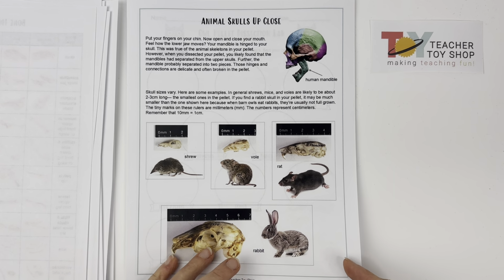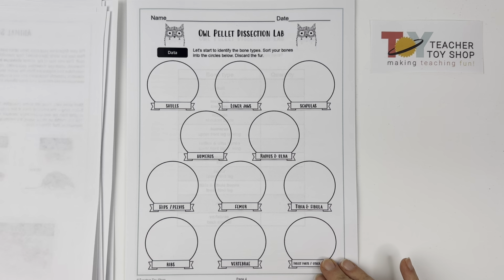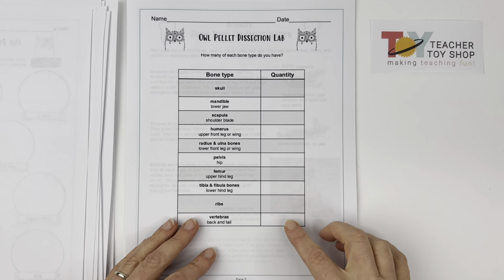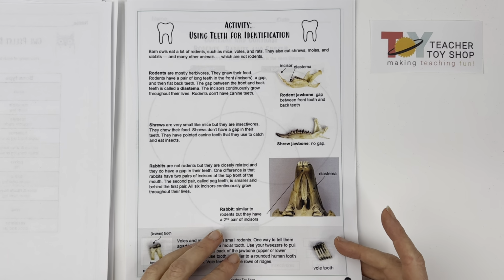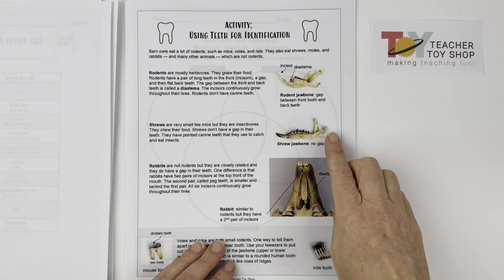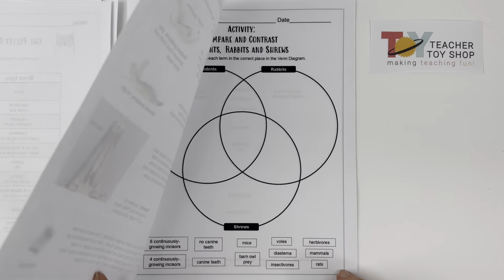This is an information sheet about the skulls, their sizes, and more explanation about what they'll find in the pellet. This is the sorting sheet where students sort the different types of bones that they find. Then the students find the quantities of the bones. They'll use that for a later activity. Then, in order to figure out what they have, there's an activity on understanding what rodent jaw bones look like versus other animals, rabbits, and even pulling out the teeth to figure out whether or not they have a vole or a mouse or a rat.